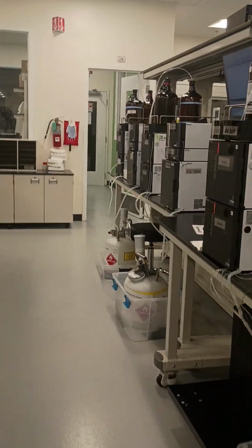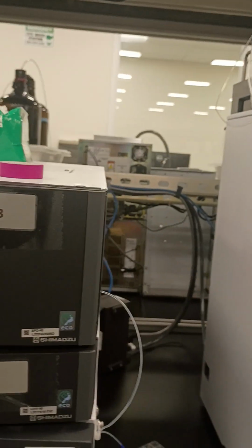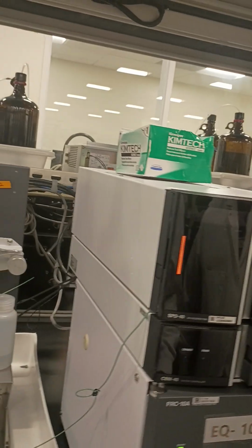This one is still running, so you're going to see that blue light that's on your paperwork. It says blue and then red. This is for the analytical. This one right here means it's shutting down now. If it was on, it's going to be blue. And to turn it on, it's the same thing.